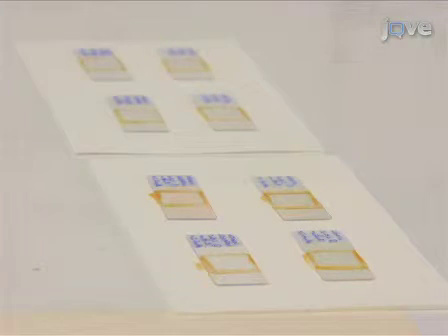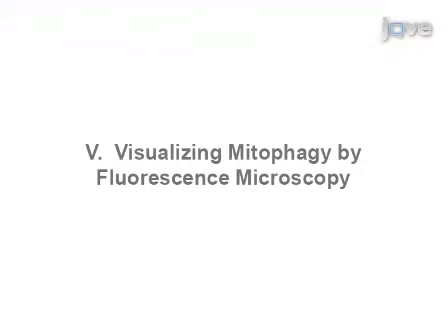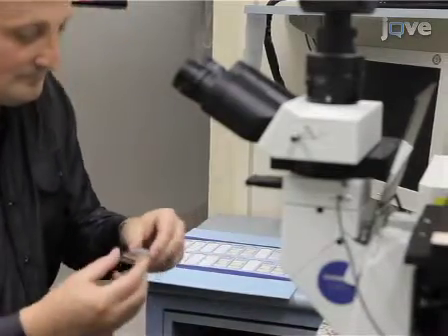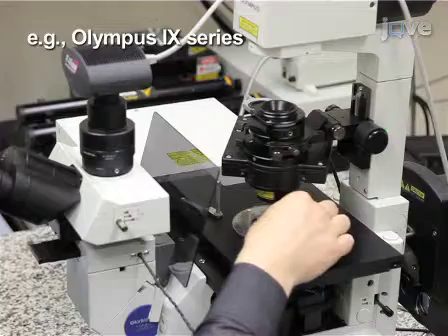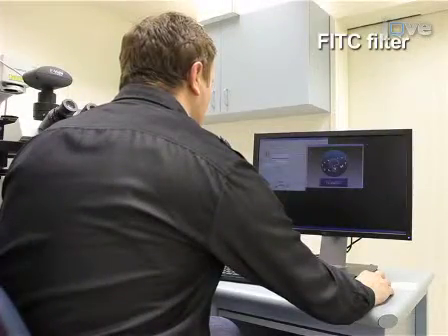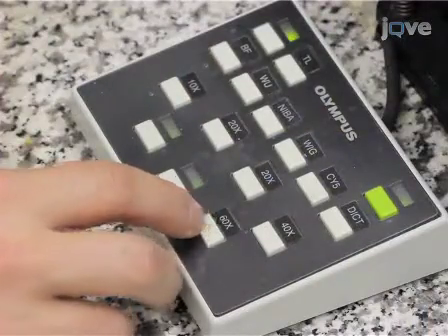Cells mounted using this technique can be observed for up to one hour after mounting without any apparent adverse effects. Since yeast cells are relatively small, you will need a good quality fluorescence microscope equipped with excitation-emission filters suitable for the separate visualization of GFP emission and RFP emission, and a 60x water immersion objective lens with a numerical aperture of 1.2.